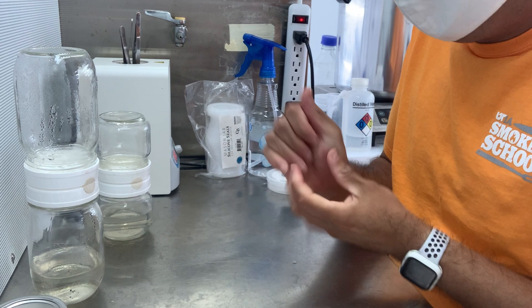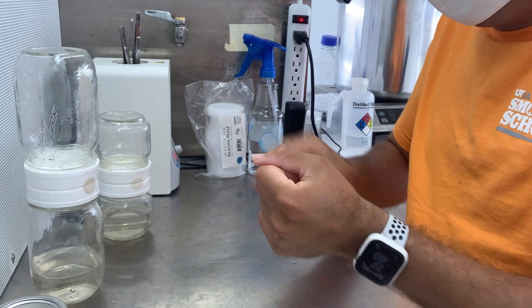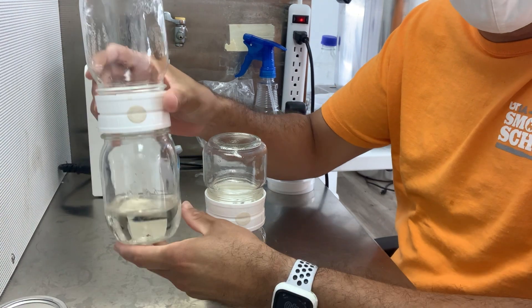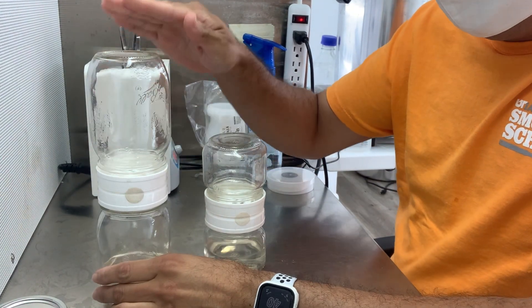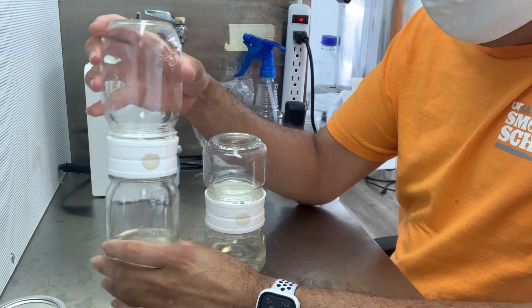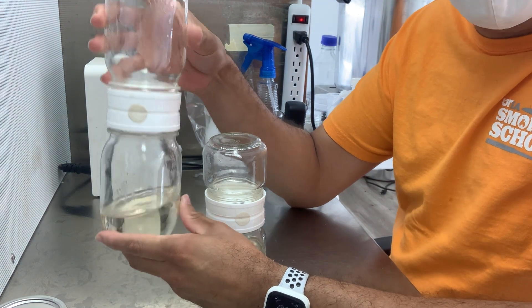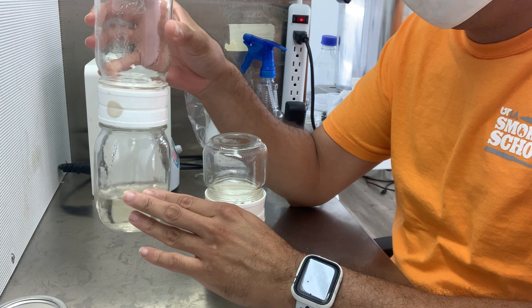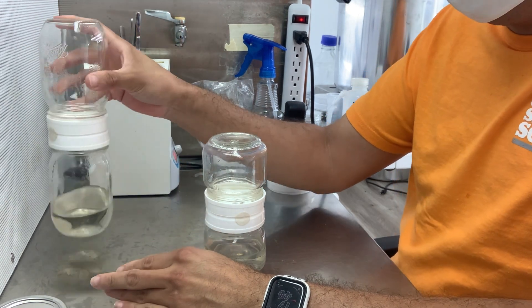Alright, the media is out. I have the pressure cooker here. I decided last moment to use the 16-ounce mason jars. I probably should have added more media, and I'll do that next time — for now I think it's okay. So let's pull the plants.